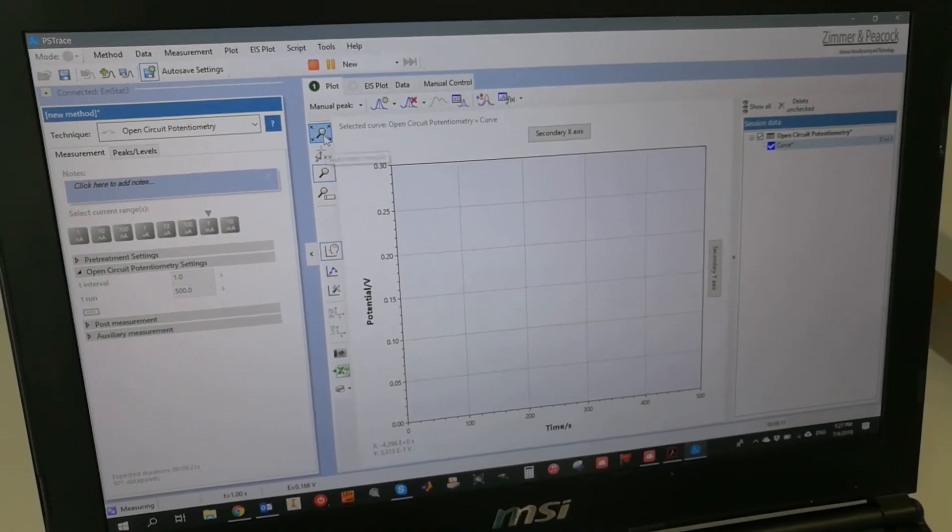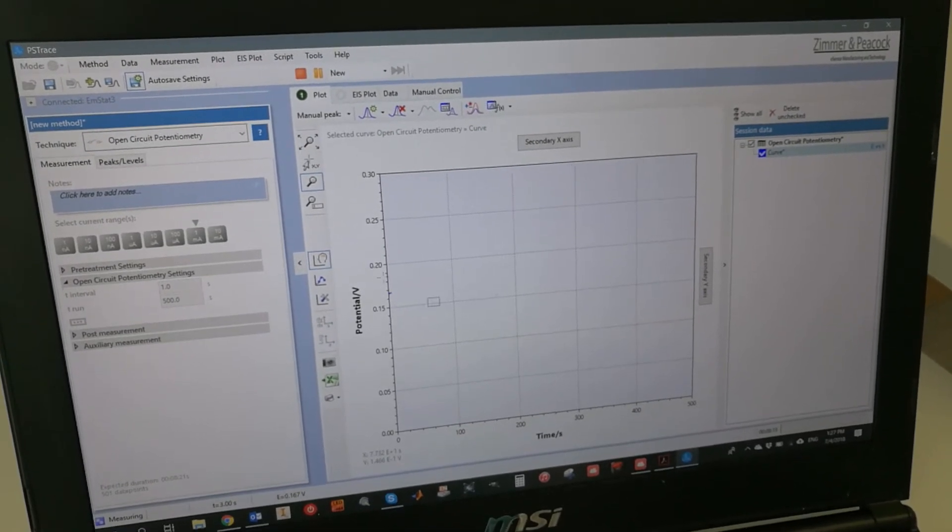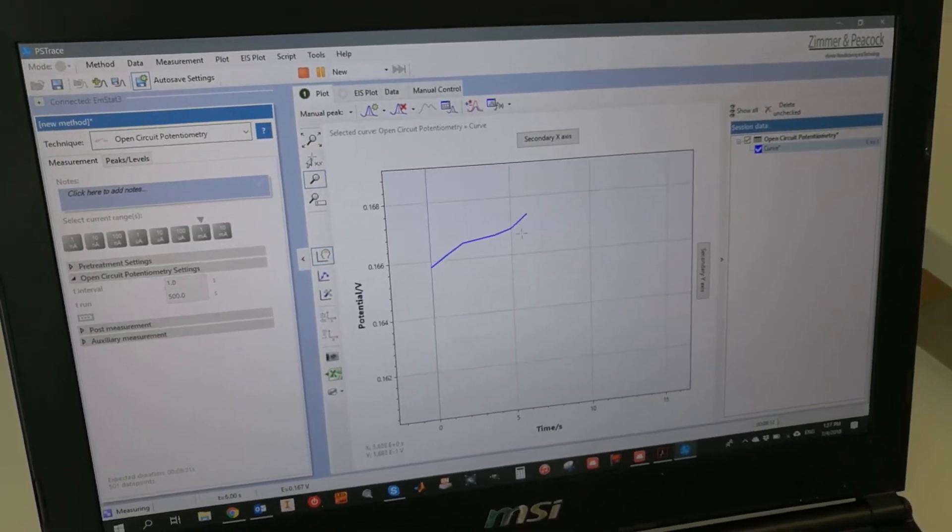If we wait a bit, we'll see the baseline very soon. Here it is. Here's the baseline.